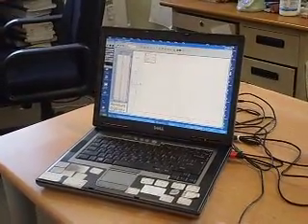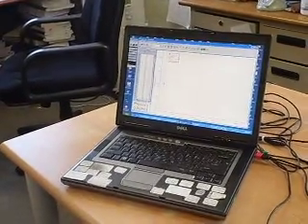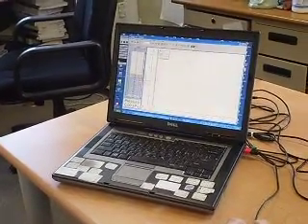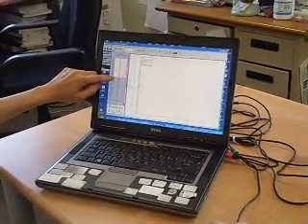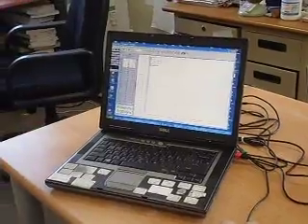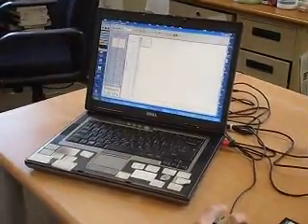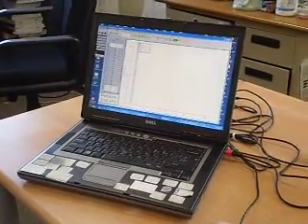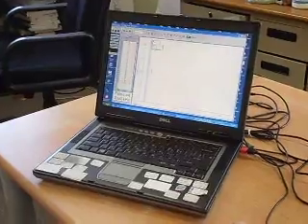And I'm going to highlight for the first probably 20 seconds. So 44, 45 plus 20 will be 65. So I'm going to highlight to 65 for the first 20 seconds. So I've highlighted it. Look for linear fit.